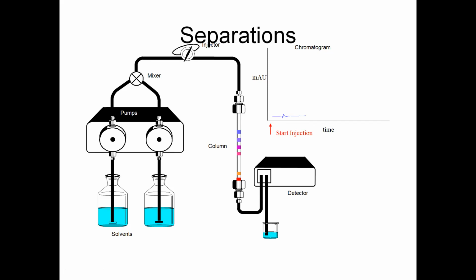Because, sir, nothing has reached the detector, so there is nothing to detect. Now you see very carefully, the first compound has reached the detector. When the first compound has reached the detector, you can see a peak.